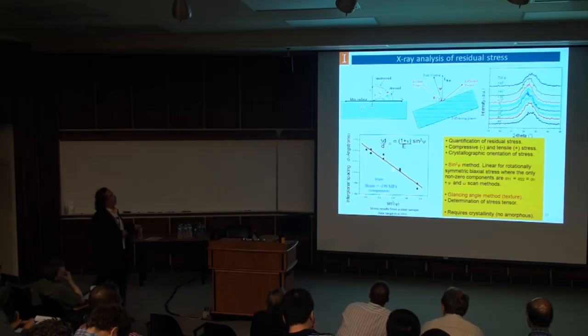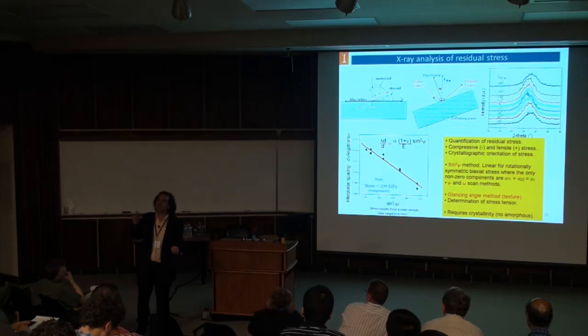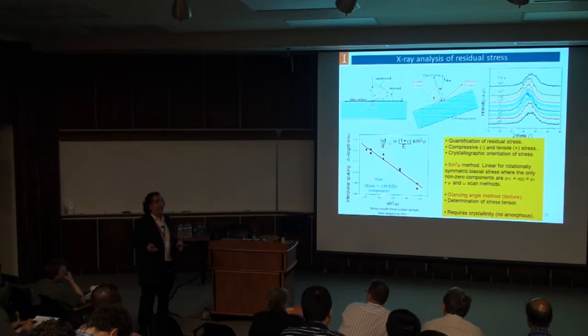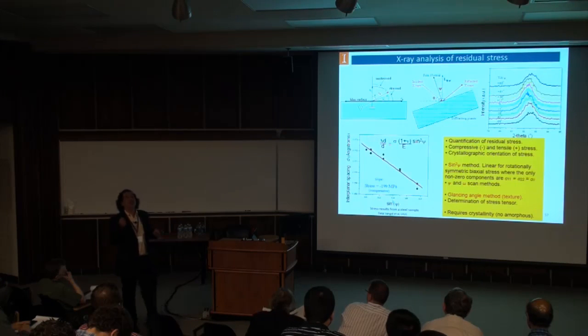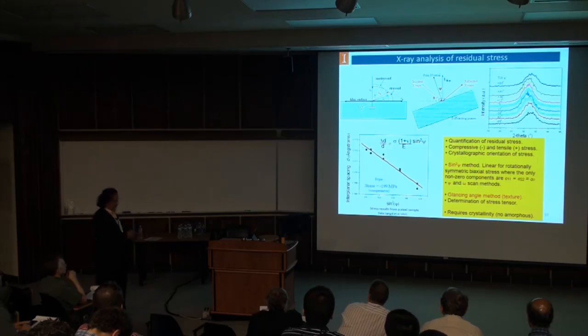What I want you to take from this slide is this. Can X-ray measure residual stress? Yes. Can it quantify it? Yes. Can it tell if it's positive, negative, compressive, tensile? Yes, it can do that, but you need peaks. If the material is amorphous, you can't do that. You have to use other methods.